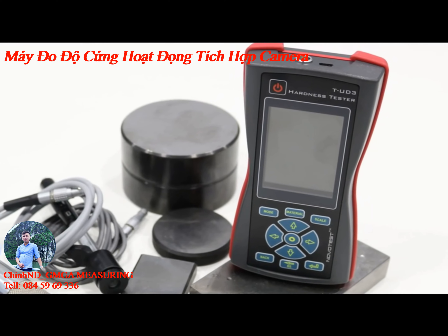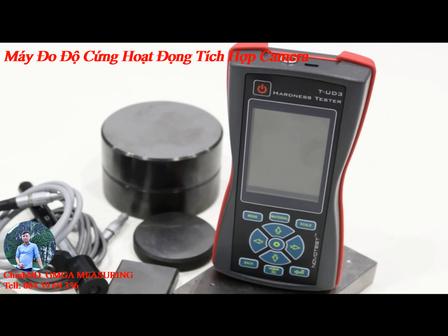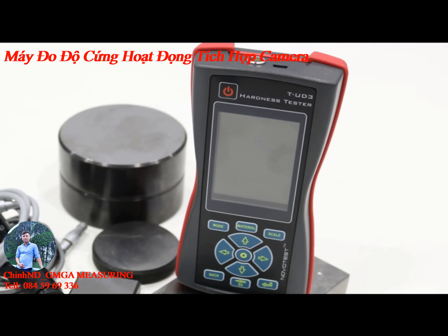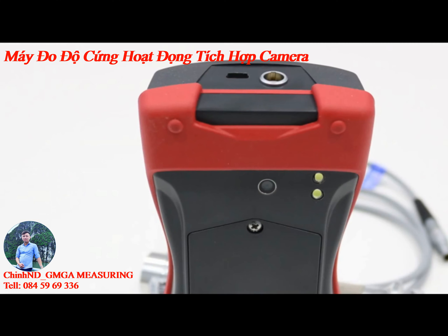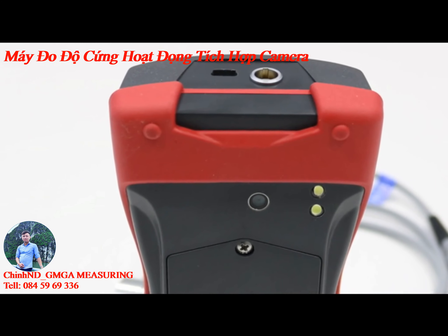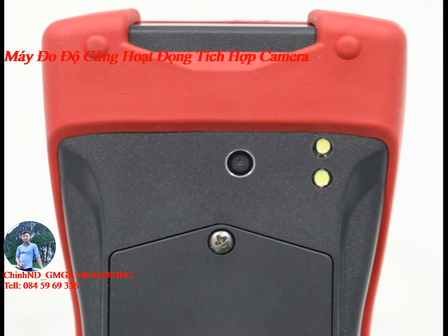Meet the latest for today: the third generation of portable hardness testers. The third generation of hardness testers is unique in its class for having a photo camera. Using the camera, you can readily create detailed reports about your measurements.